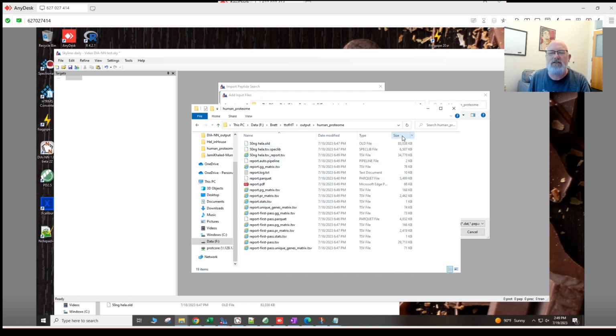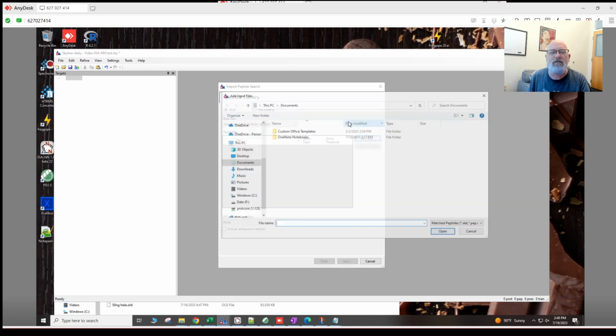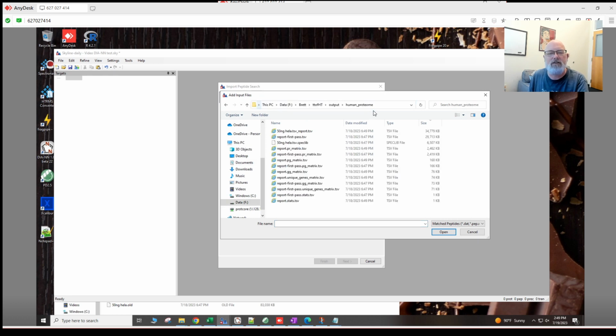Okay, why didn't that work the first time? I don't know. Let's make sure we're loading the right file in here. So add files, we're going to go to make sure we go to the right one. We'll give it, do we see that old file in there? Let's see. We should, right? Where'd it go?